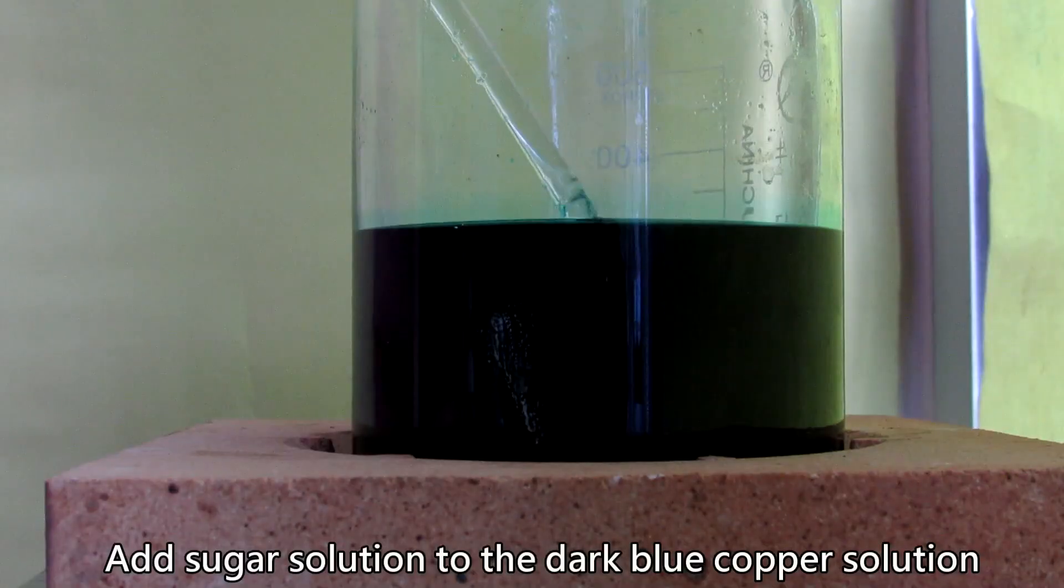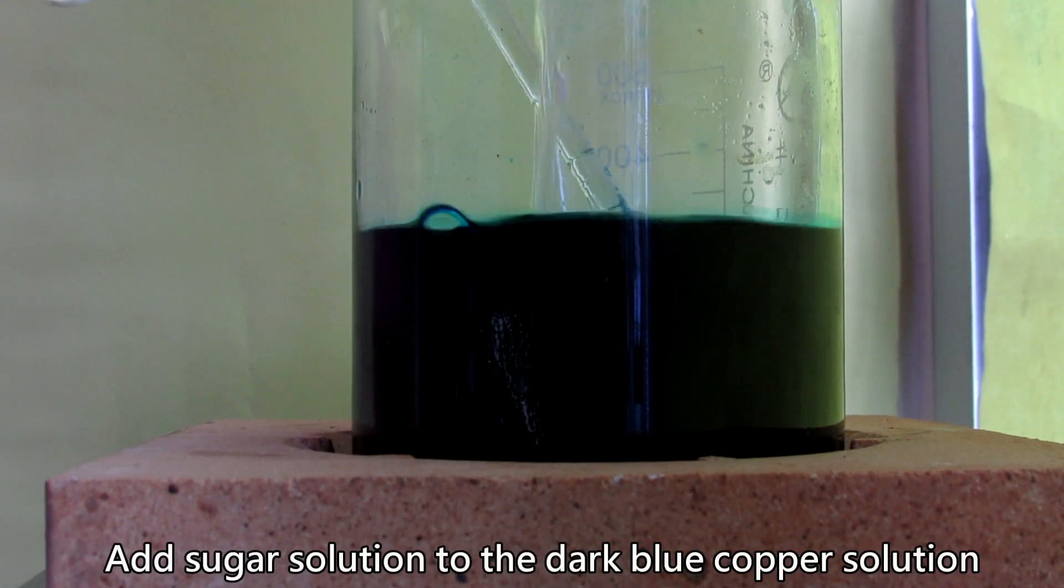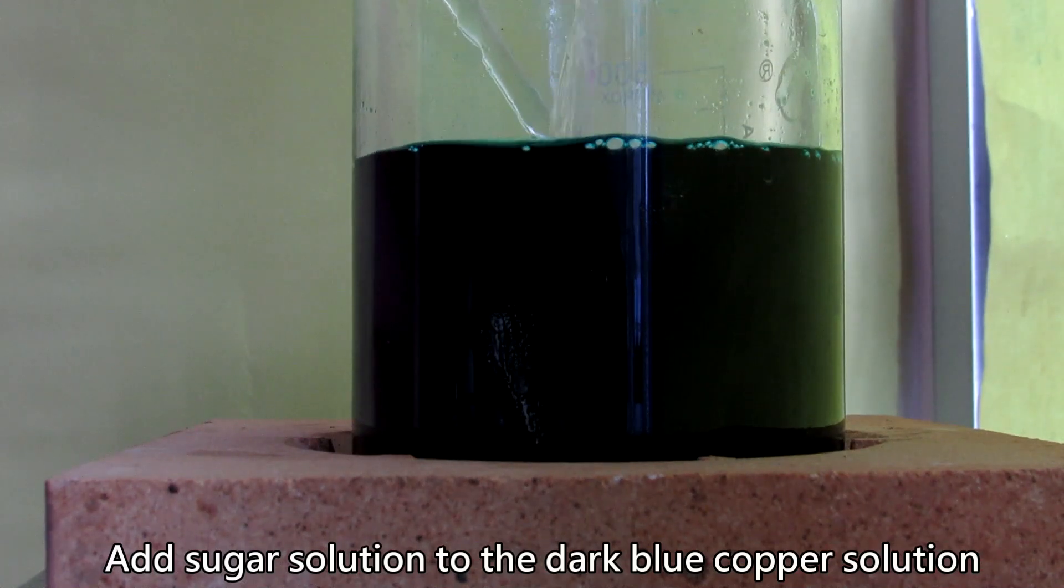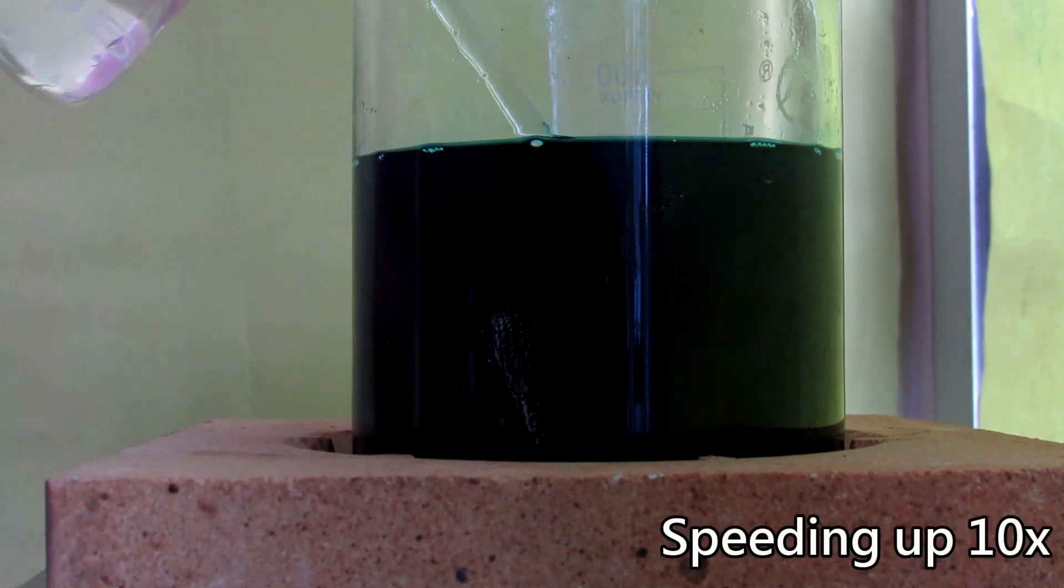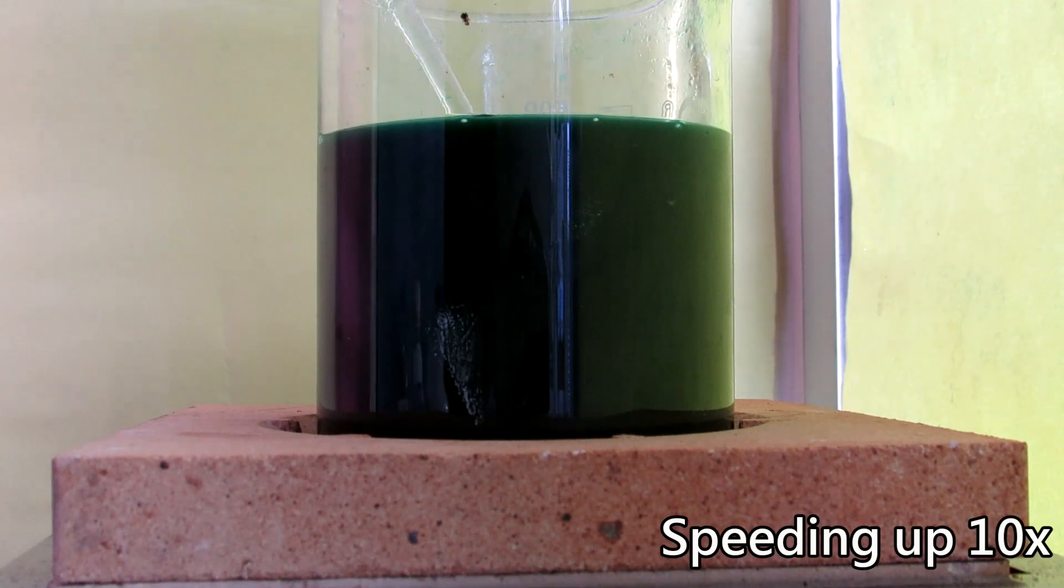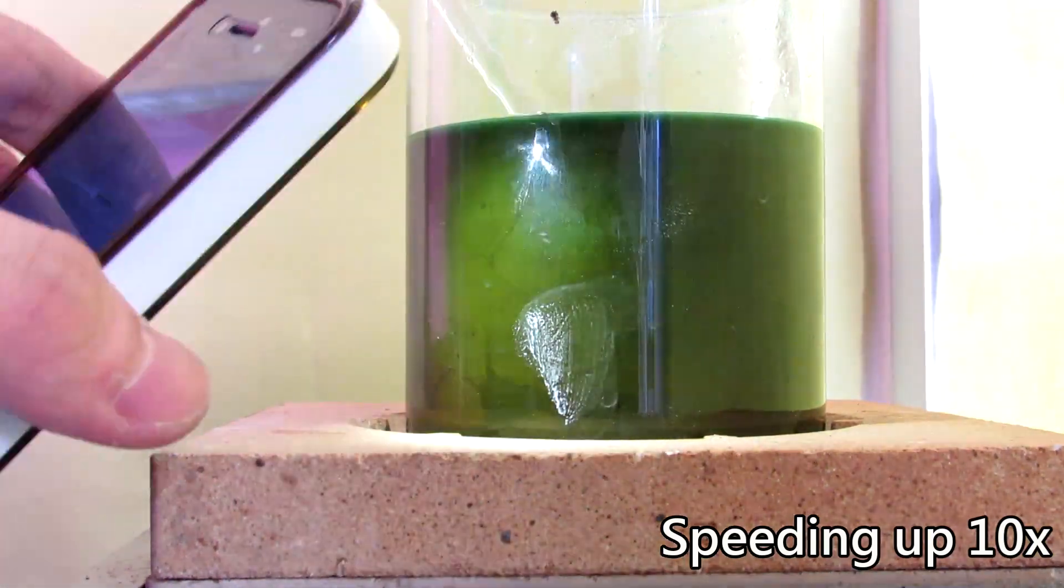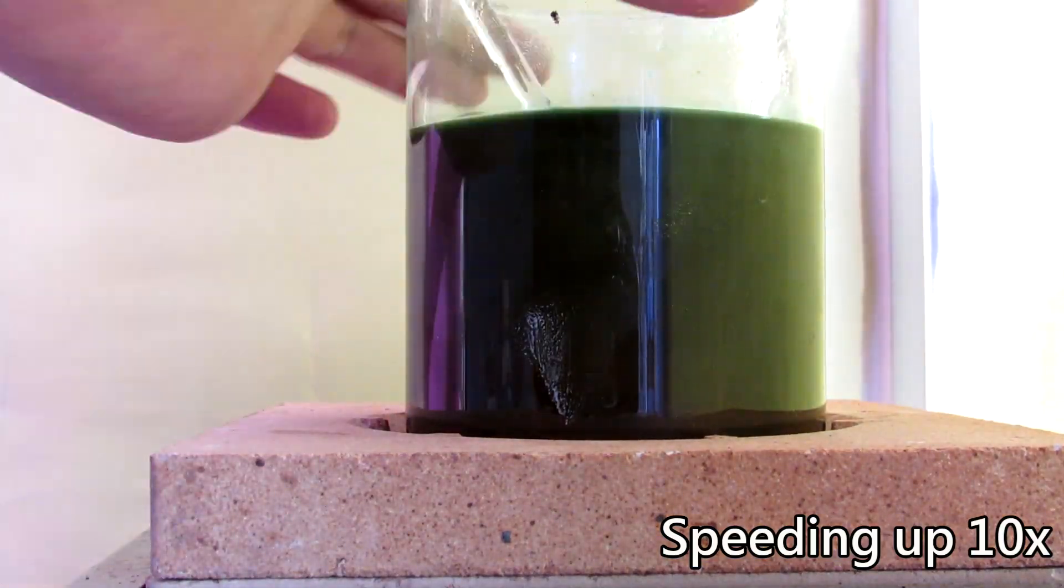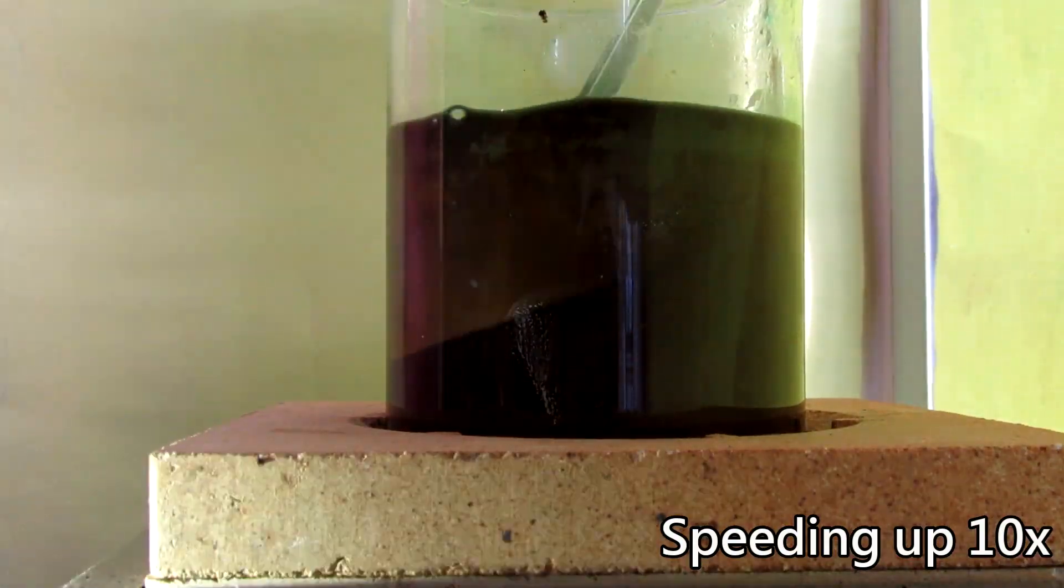Then add the hot reducing sugar solution to the deep blue solution. Then continue heating the solution and wait for the formation of red copper oxide. The color of the solution should slowly turn from deep blue to green and then to yellow and red. As you can see in this shot, the upper part of the solution is relatively blue and the lower part has already turned reddish orange.